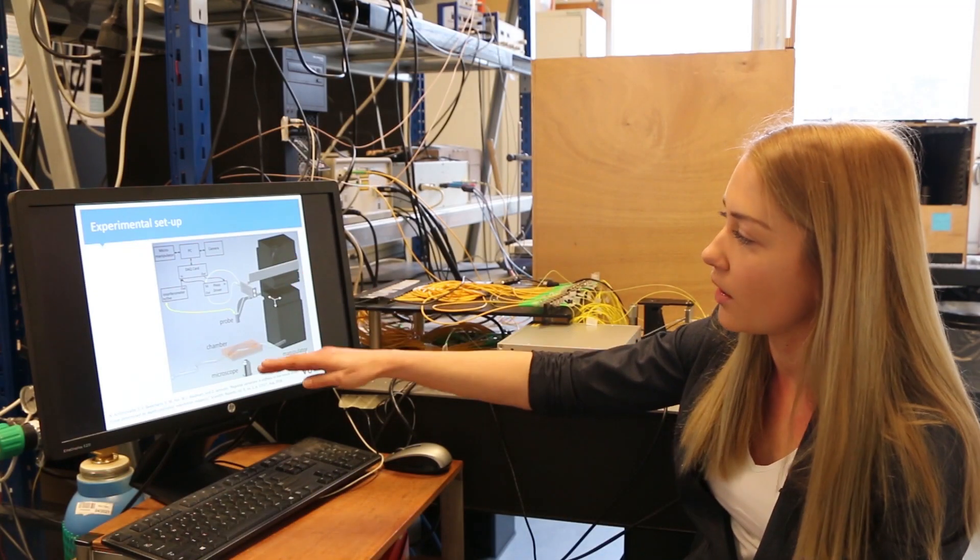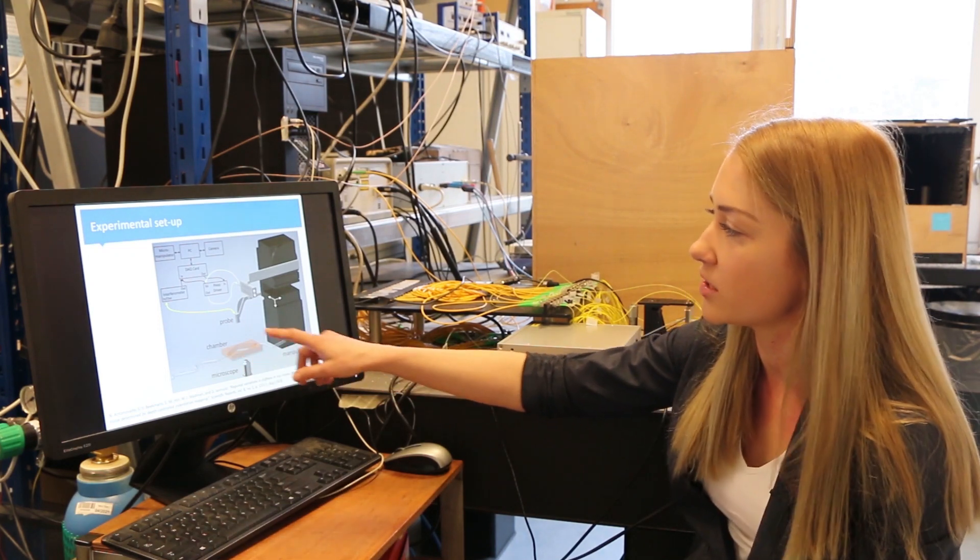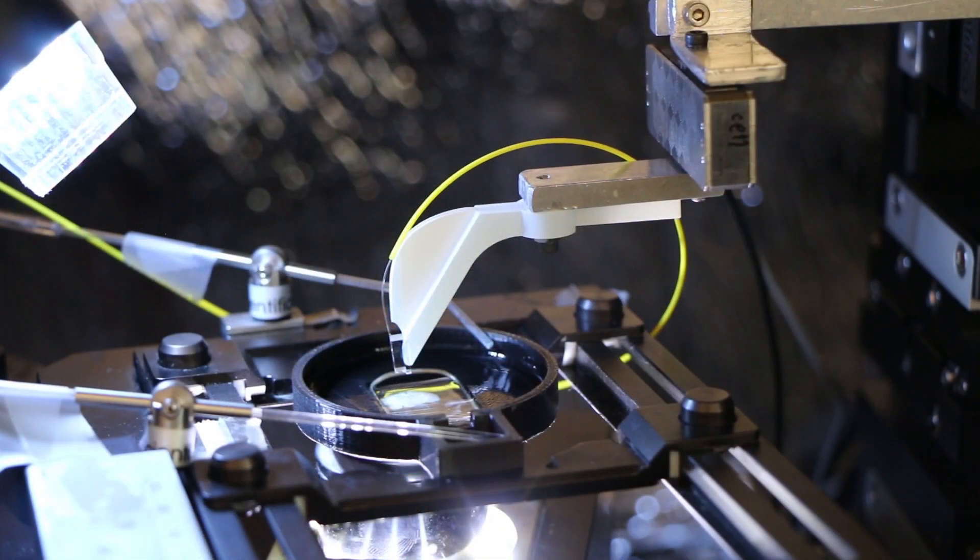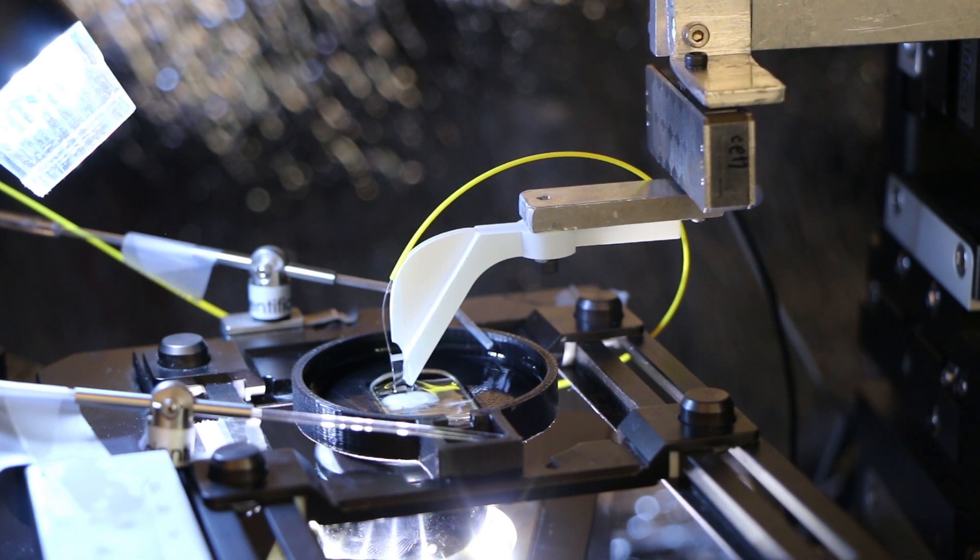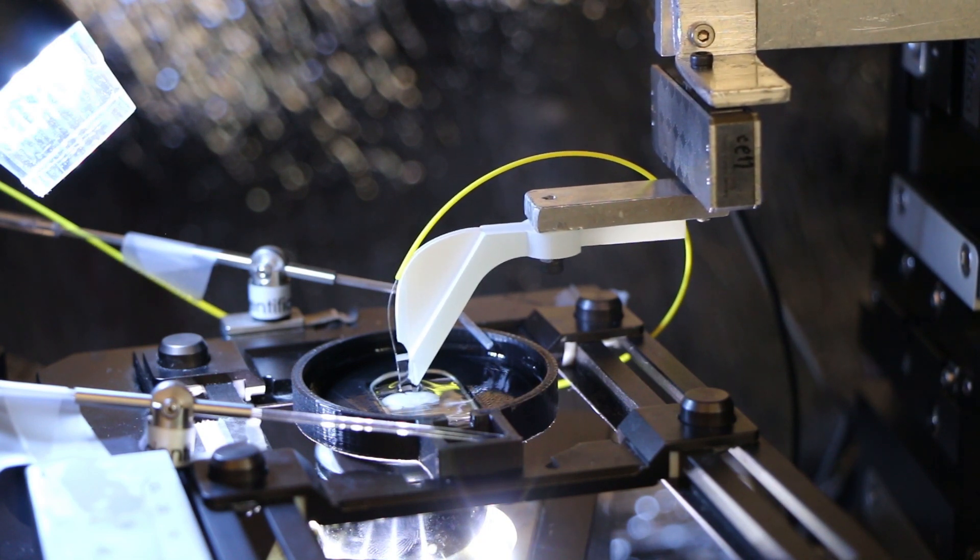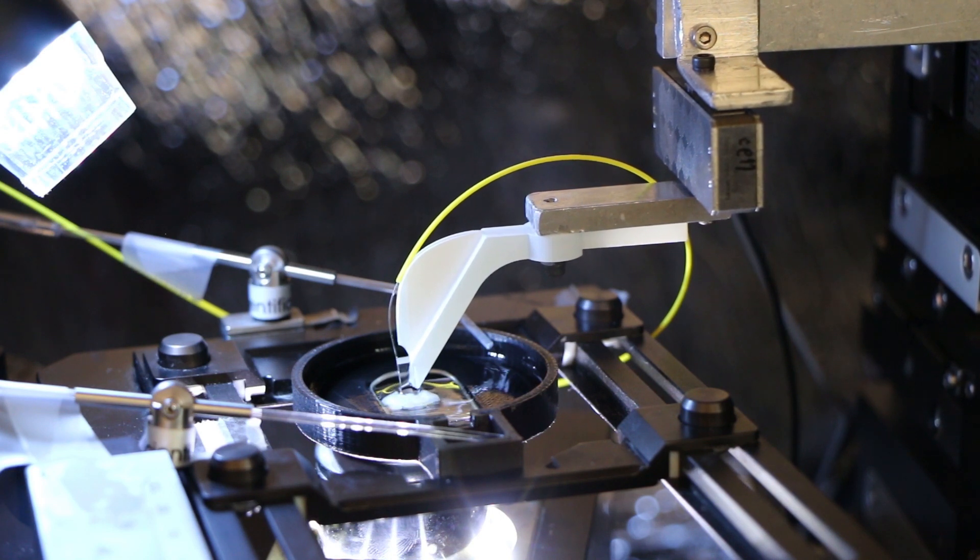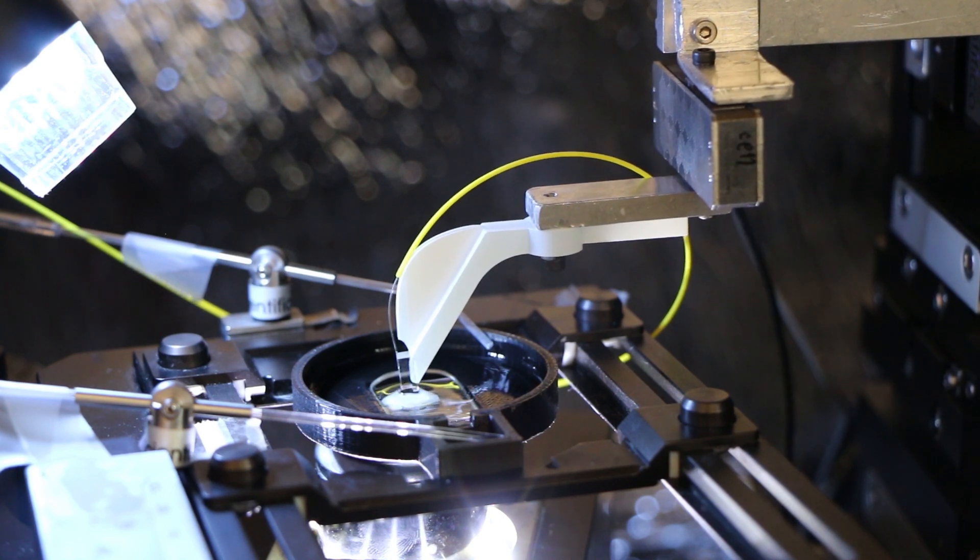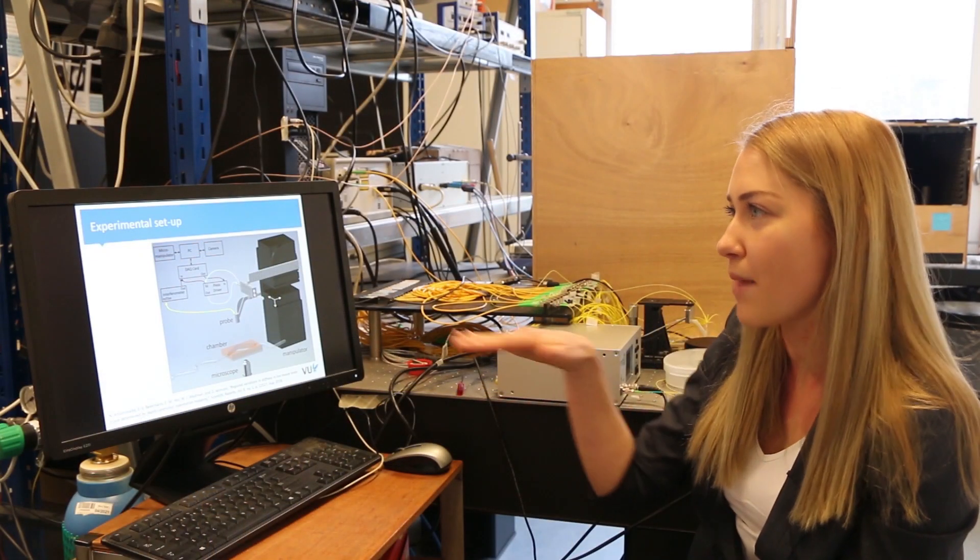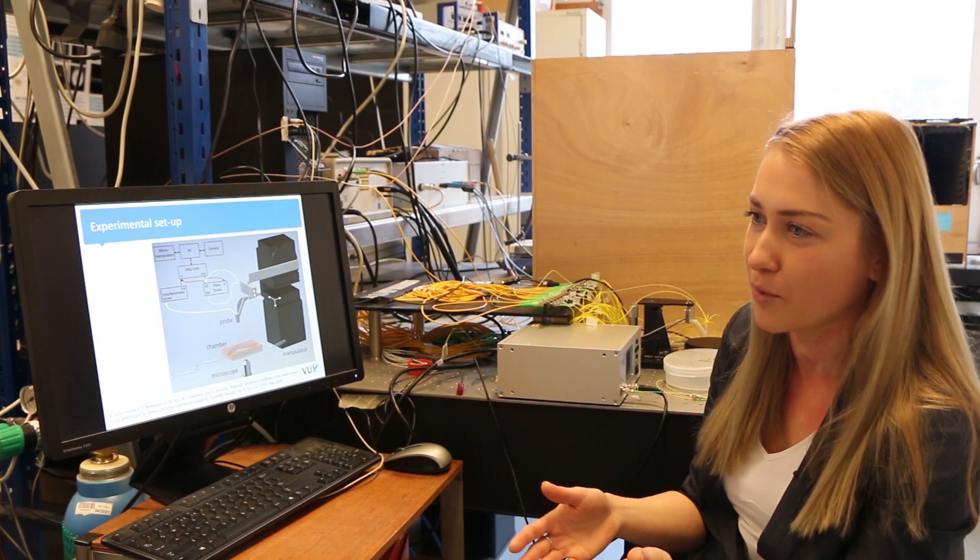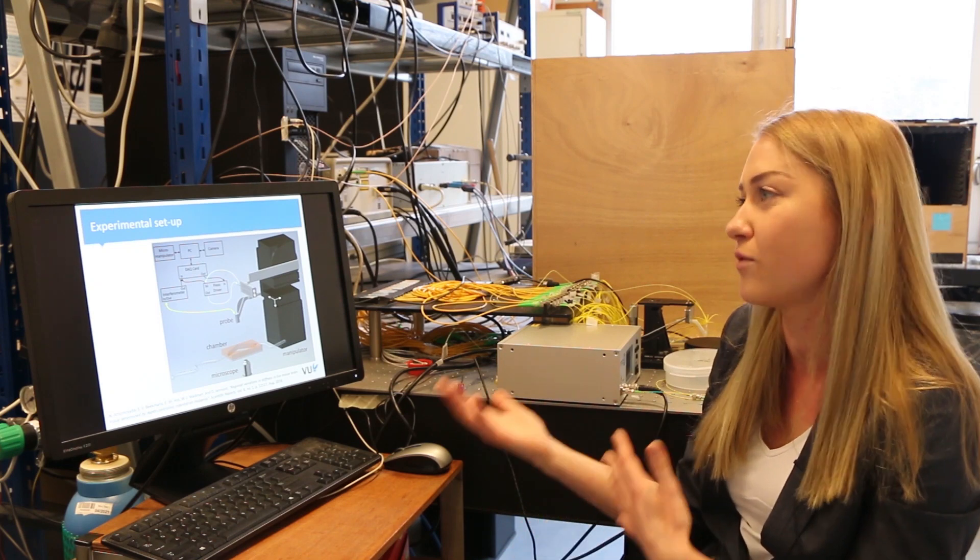We approach the sample which is mounted in this chamber and then we can perform indentation by scanning over the sample. And at the same time we can look at the microscope underneath to see which brain region we are measuring and how it looks like and use that information to map, to correlate mechanical properties to the actual structure of the brain.